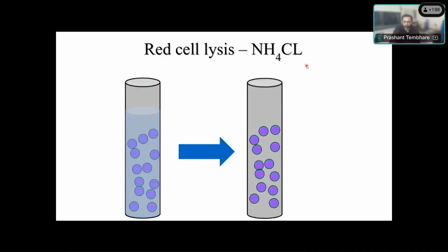And then we add antibodies which have fluorochromes attached to them. So you can see there are antibodies with different fluorochromes attached to them against specific antigens. So we study different types of proteins which have antigens on them, and these antigens are studied by using different antibodies which have fluorochromes attached, so that they can be detected by using flow cytometry.